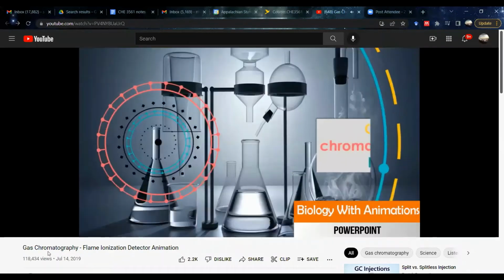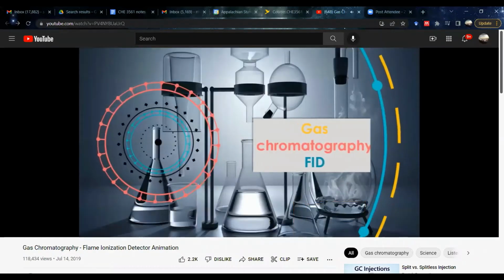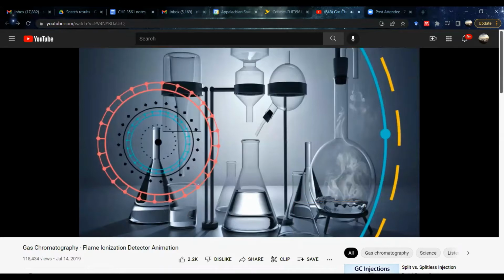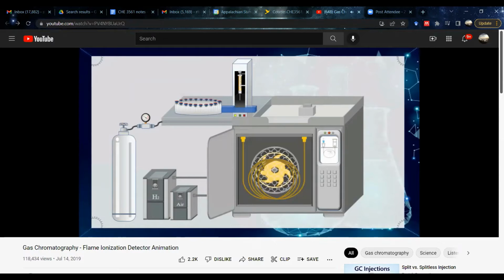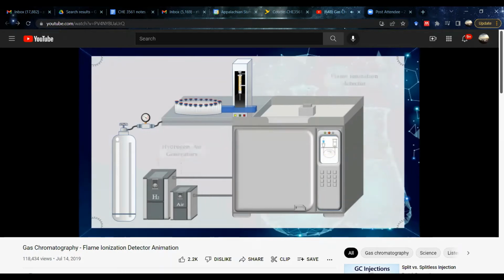Gas chromatography, GC, is a common type of chromatography used in analytical chemistry for separating and analyzing compounds that can be vaporized without decomposition. In gas chromatography, there is a mobile phase, which is a carrier gas, such as helium, nitrogen and argon. And there is a stationary phase, called a column, which is located in an oven where the temperature of the gas can be controlled. There is also a detector that measures analytes in a gas stream attached to the GC system.